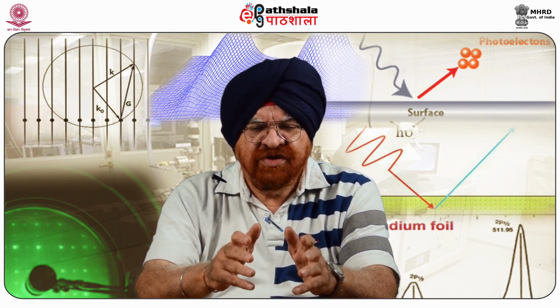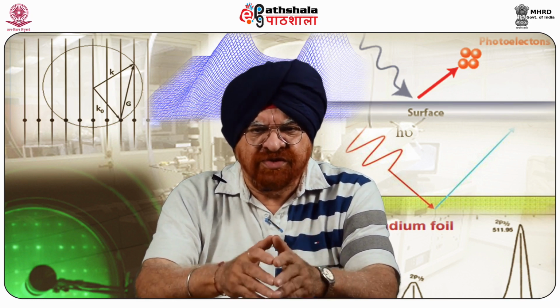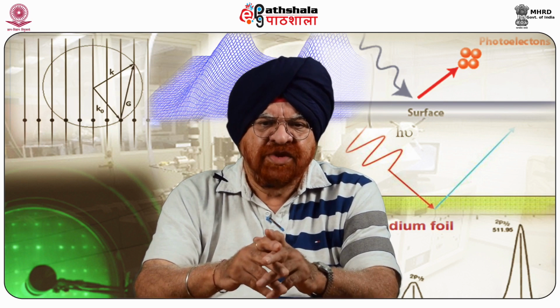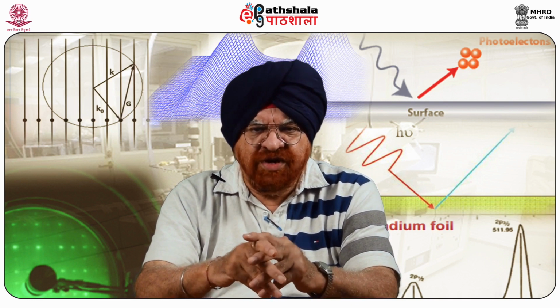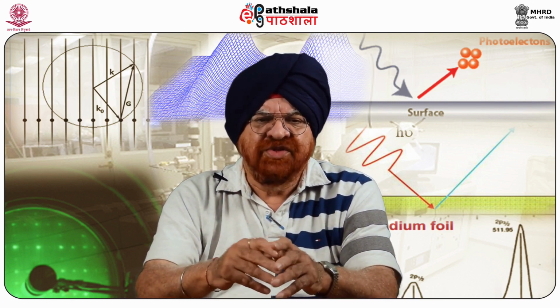High resolution electron energy loss spectroscopy is one of the most advanced instruments, mainly used to obtain the vibrational signatures of surfaces and the adsorbates on these surfaces under ultra high vacuum conditions. By assigning the vibrational modes of the collected spectrum, the chemical bonding between surface and adsorbate, binding geometry, and molecular orientation and ordering can all be identified very properly with the help of this spectroscopy.